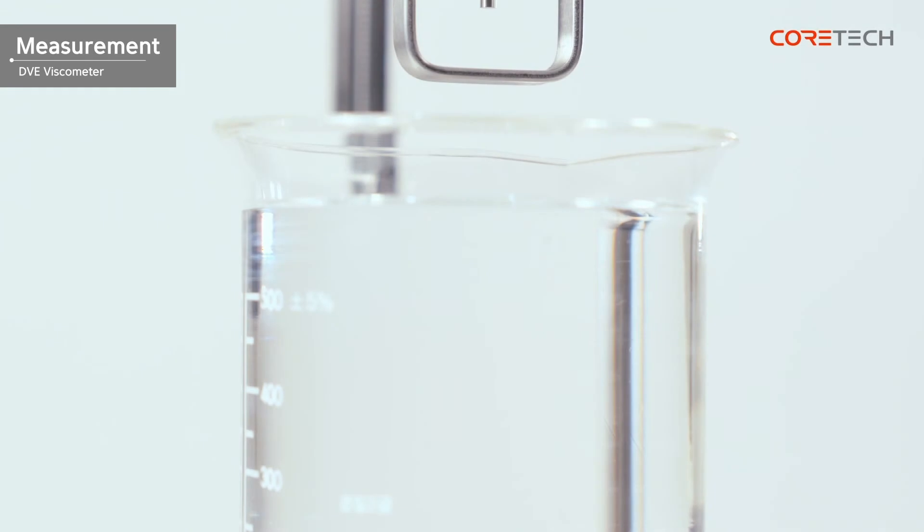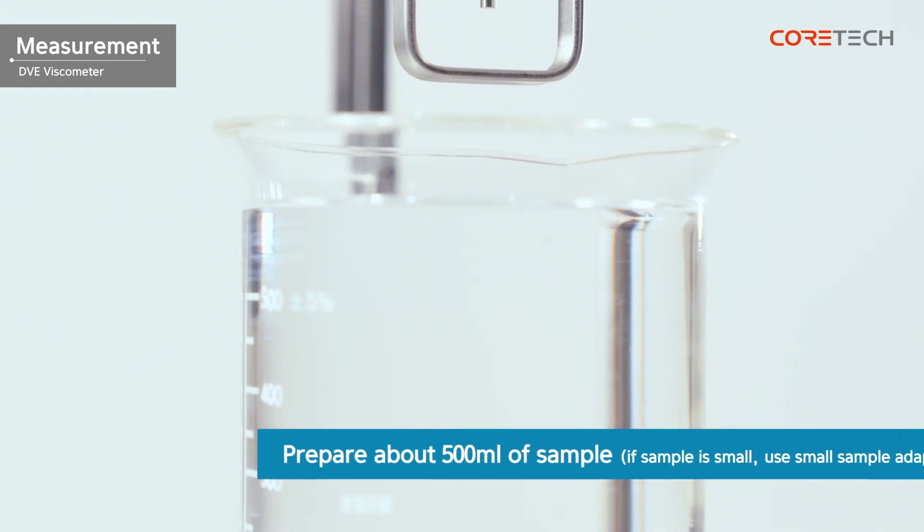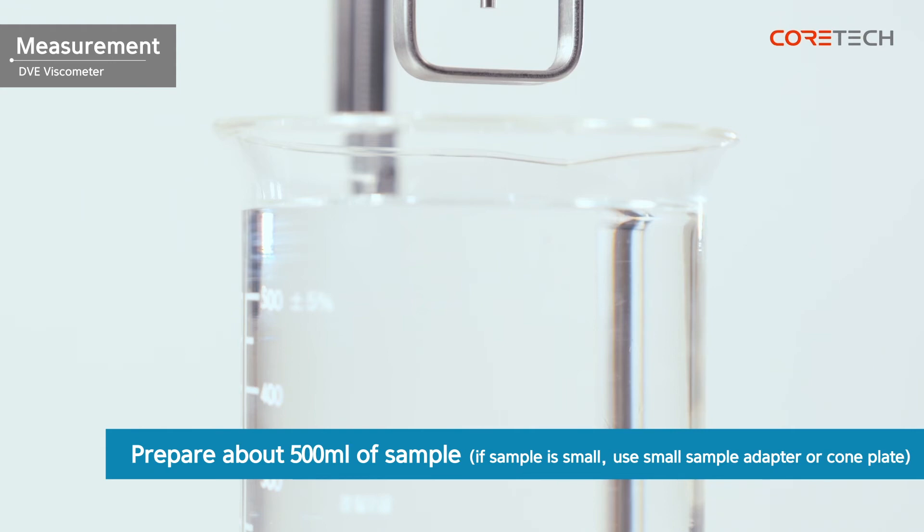Prepare approximately 500 milliliters of sample for measurement. If it is difficult to secure a sample of 500 milliliters, use the Brookfield accessory small sample adapter or cone plate.